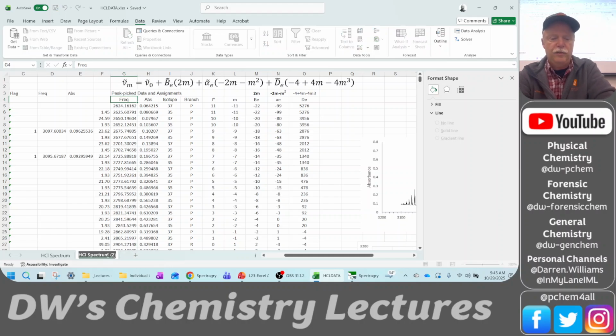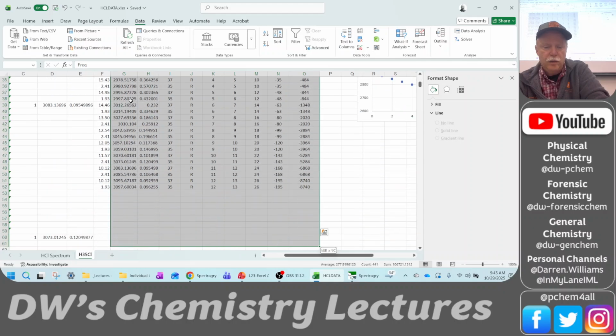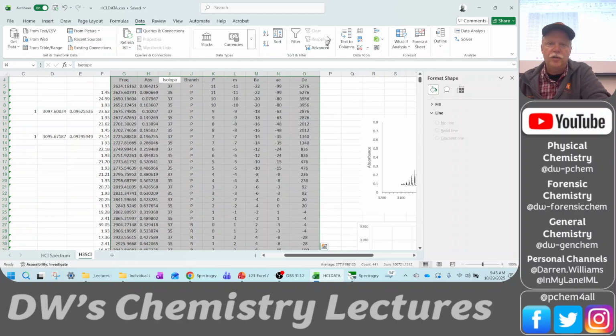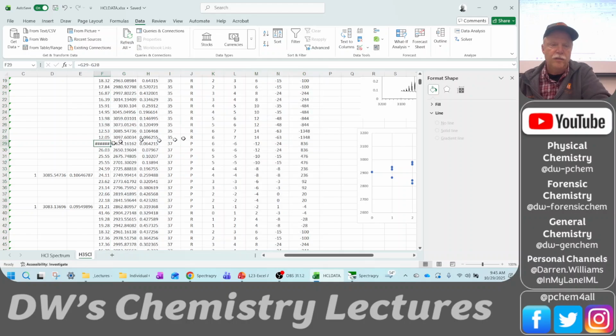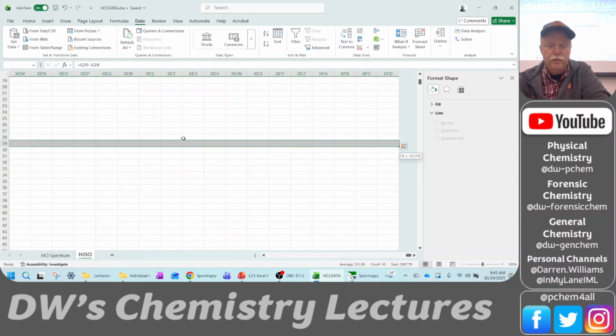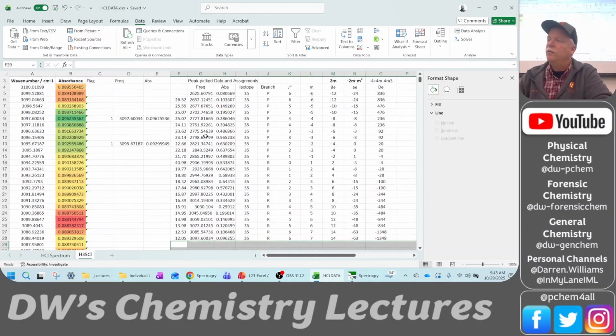So we can call this one H35Cl. We're just going to grab this whole table right here, and we're going to tab over till we get to the isotope, and we're going to do sort. Okay, and now the 35s are on top and the 37s are on bottom. And so we can go down and delete. So there's our 35 assignment table.